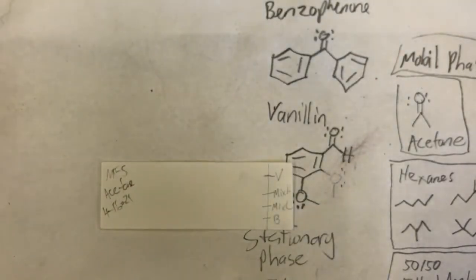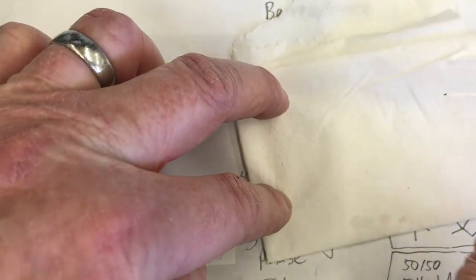Get my capillary tube. I want vanillin first. Vanillin alone. Here it is. Put my capillary tube into the solution. Pull it out, and first drain it mostly onto a piece of paper towel. And now I can spot it on my TLC plate. Let's see if it's visible for you guys. 1, 2, 3. Oh, I think that was a nice little one I got there.